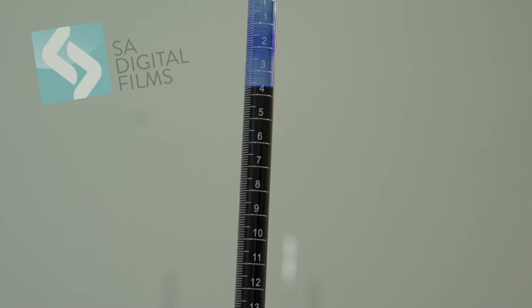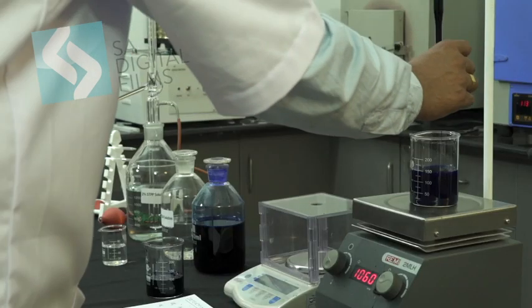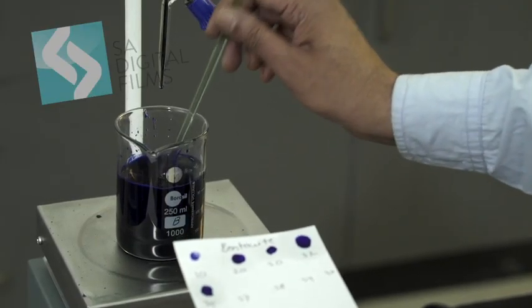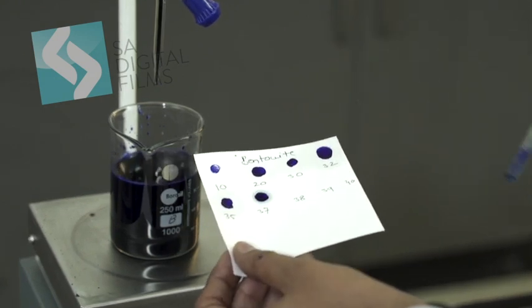Step 6. Add 80 to 90% of estimated methylene blue solution 0.01 N. The suspension is then stirred for 2 minutes. Dip the glass rod in the suspension and place a drop on the filter paper to test the presence of blue-green halo.